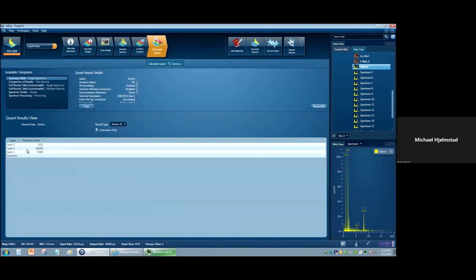And so when we count it here, you can see that there's just more material missing, and it's missing from the top half. We're not missing anything right on that chrome adhesion layer. We're missing some fraction of the copper, and we're definitely missing some fraction of the top gold surface there. So somebody's been trying to steal the gold right off this.